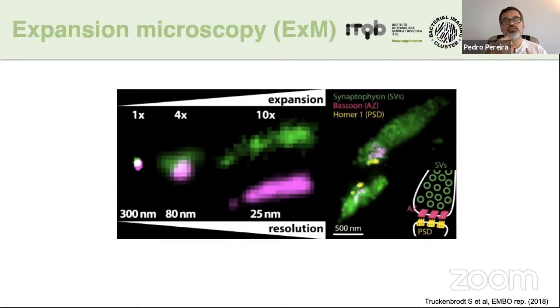which is also another interesting thing to have in mind, because you should be aware that you're never seeing your sample or your target of interest. What you're seeing in a microscope is the fluorophore or the probe with which you tagged your target of interest, okay? So when you think, I want a hundredfold increase in resolution, that makes no sense, because you're now seeing the antibodies, you're not seeing your target of interest anymore, right? So the error starts becoming so big that the biology loses logic, okay?